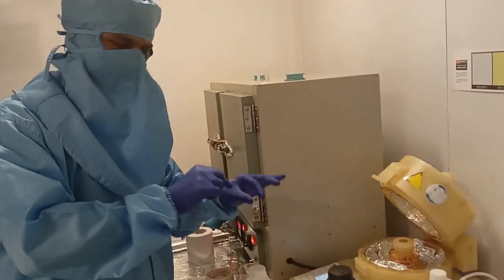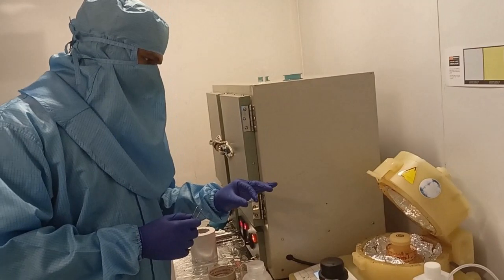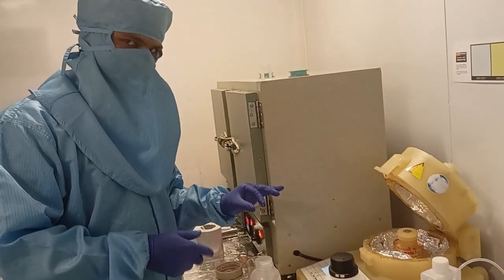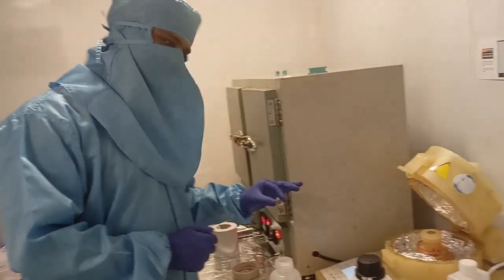We will use photoresist for that. We will drop one or two drops of photoresist, and we will coat for a while. In my case, I will coat it for 1 minute. Let's see what happens.